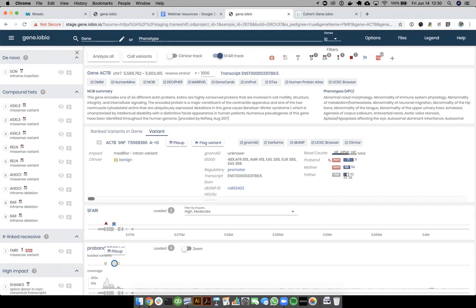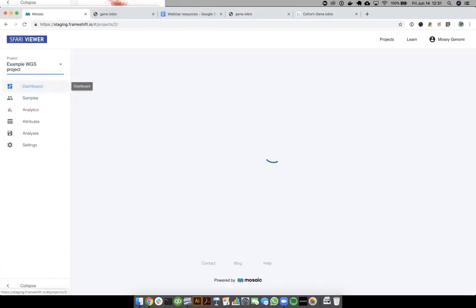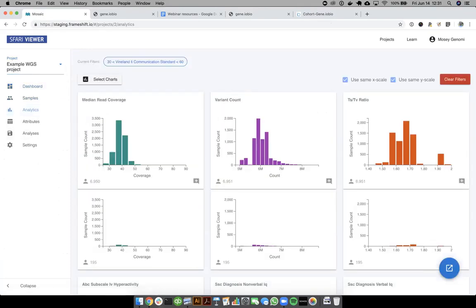So this is a really cool tool that has a great deal of functionality for really looking at an individual family level. But we may decide that we want to look not at one family, but lots of genes, but instead look at one gene across a different cohort. So in collaboration with Gabor Marth's lab at the University of Utah, we've also developed a tool that will allow us to look for enrichment in an individual gene based on a cohort that we're interested in.